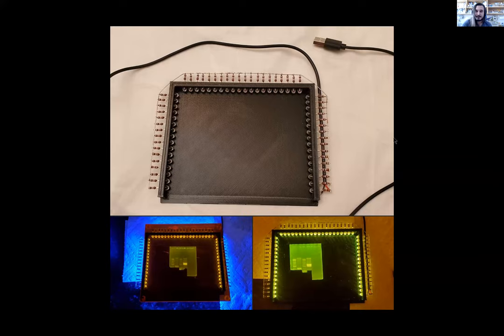So the excitation is blue, and I use a dye called GelGreen, which is super safe. It can't penetrate the plasma membrane, as opposed to SYBR Safe or worst case ethidium bromide, so it's not as toxic. Don't drink it, obviously, but it's a hell of a lot safer, and you can throw it down the drain, you can throw it in the trash, there's no hazmat. So I really like it, and I designed around that.